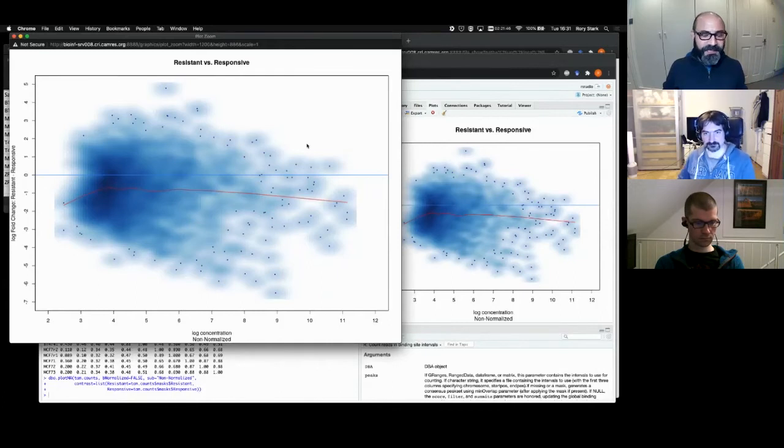And in general, if there are changes in expression, we expect them to be in both directions, gains and losses. But in chromatin and things like transcription factors, that's not the case. You could have a loss of binding in a way that you can't just have a loss of expression. If you have an experiment where one of your conditions loses all gene expression, it's dead. Right? There'd be a clear phenotype. It would, but you could have a much bigger change. And this is one of the key ways that these enrichment data are different than RNA data.